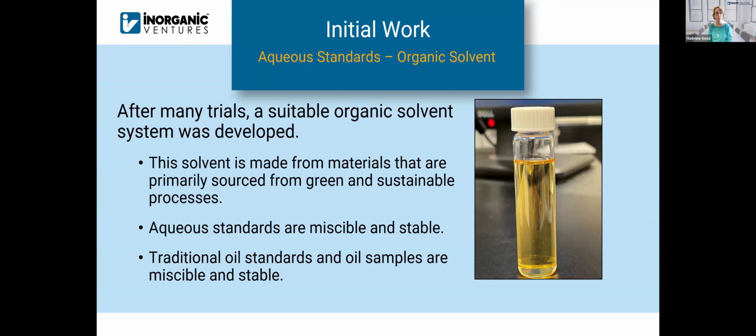The aqueous standards that we have are miscible and stable in the solvent, and traditional oil standards and the oil samples are miscible and stable in the solvent.